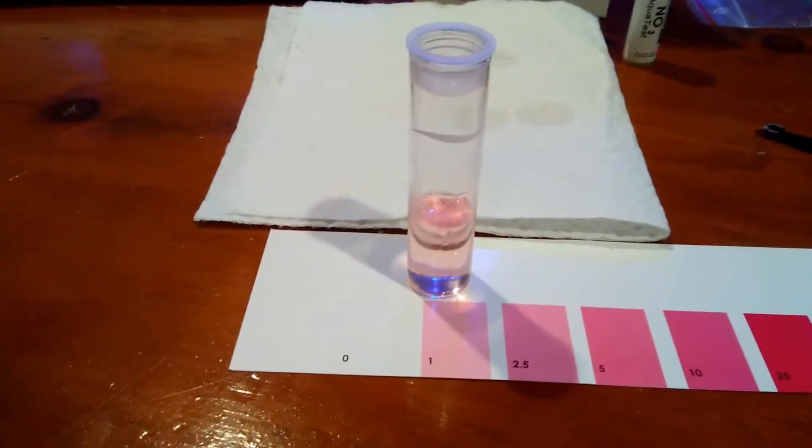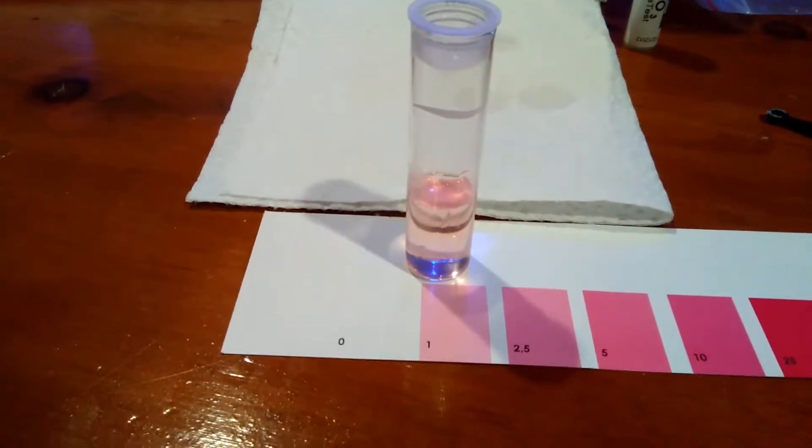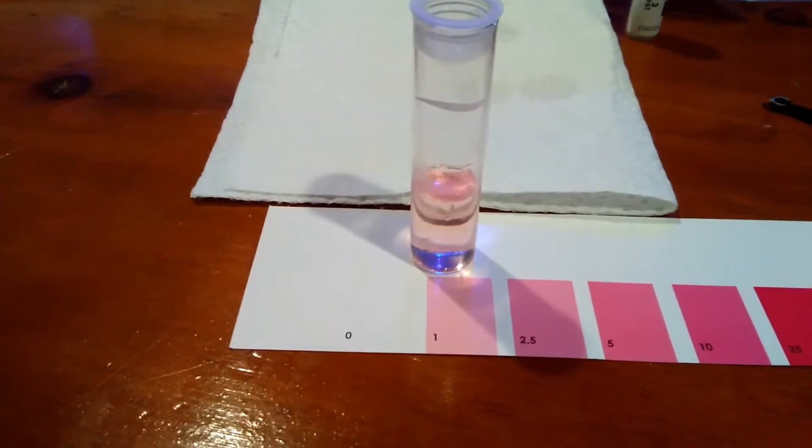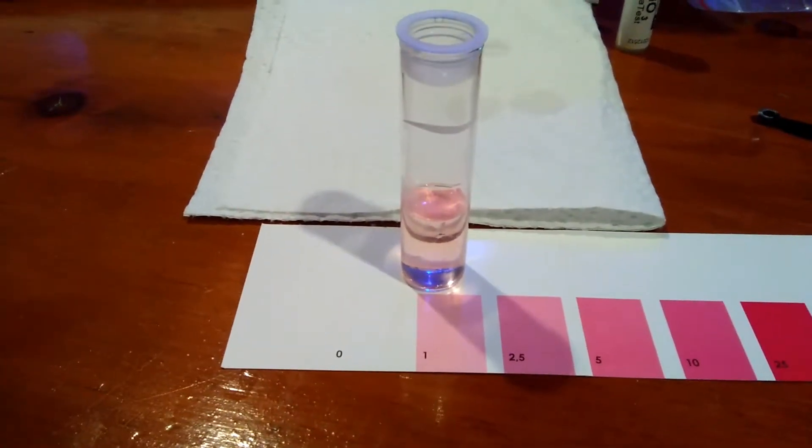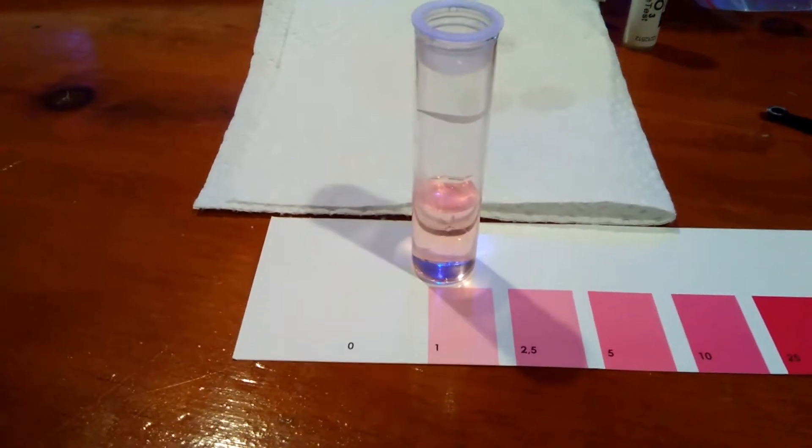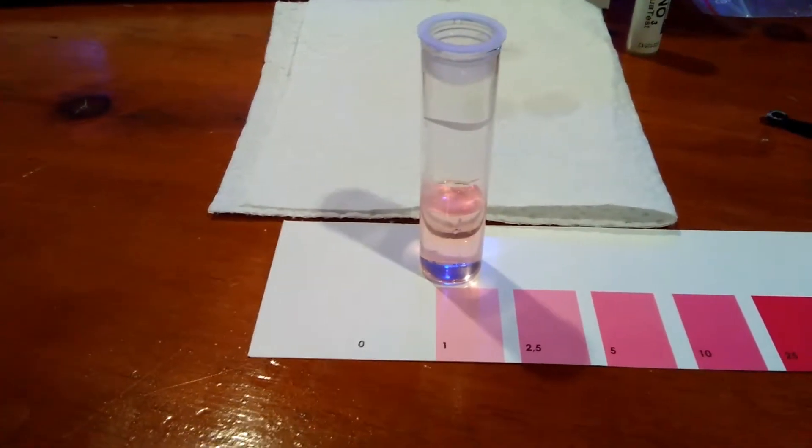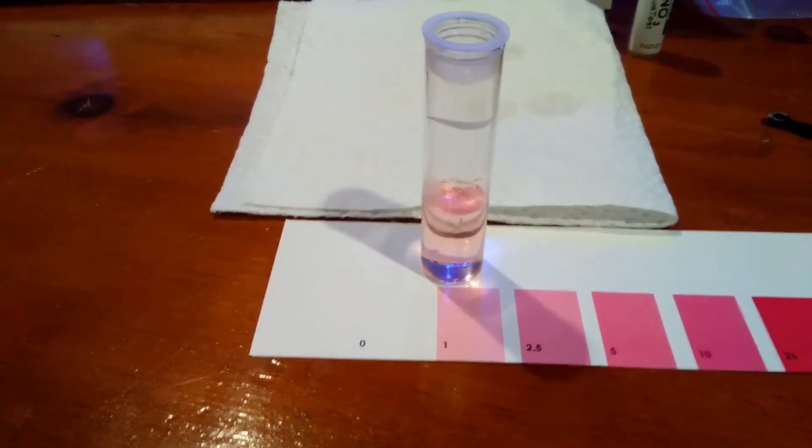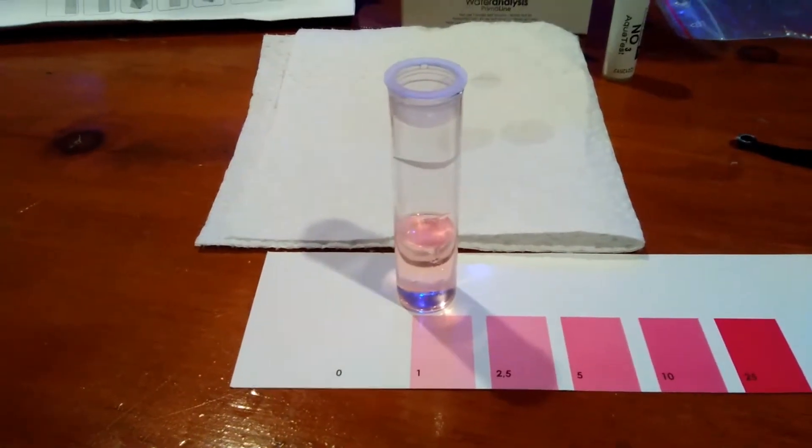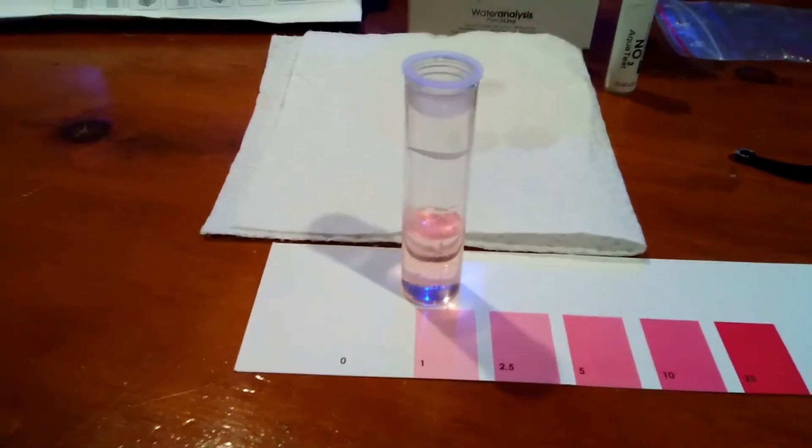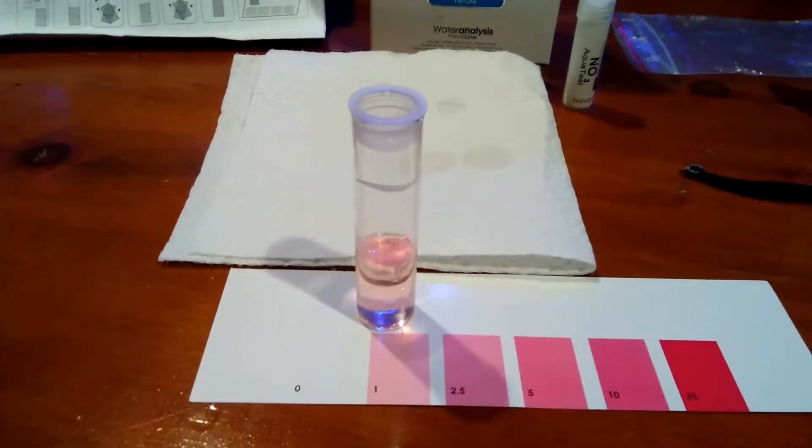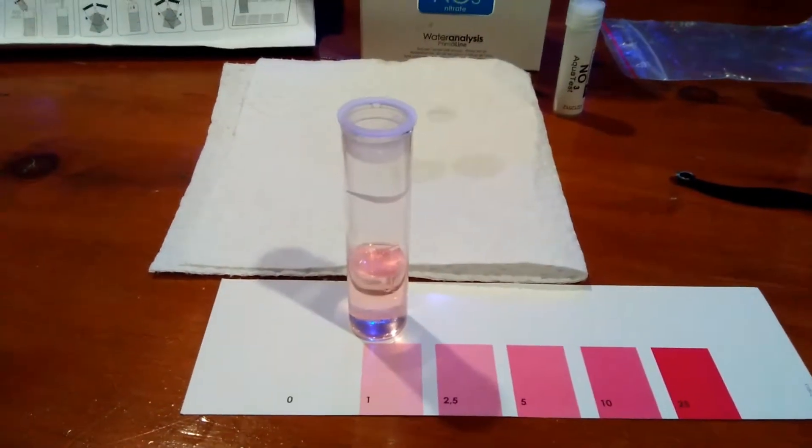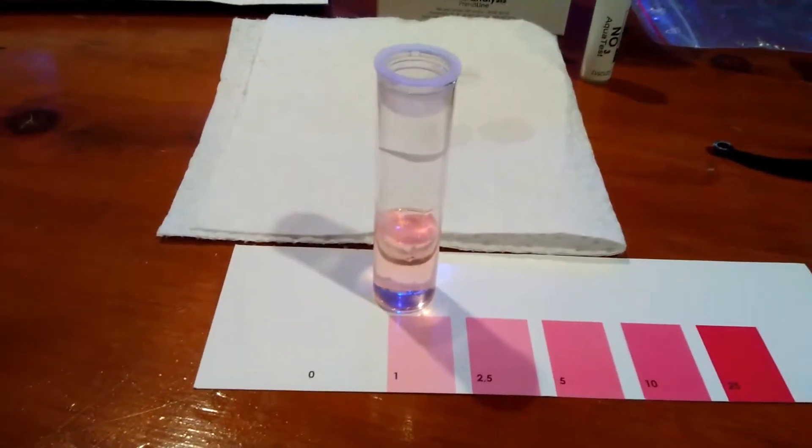But this test kit, it's awesome. It's easy. And you know what? It's accurate. That's the part that is awesome because it's actually certified with NIST, which is the National Institute of Standards of Technology. So these reagents are all perfect. The shelf life on them is never too long. They always rotate them around.